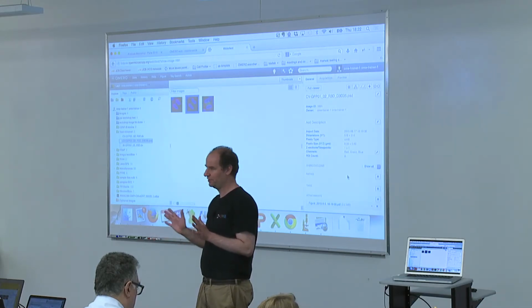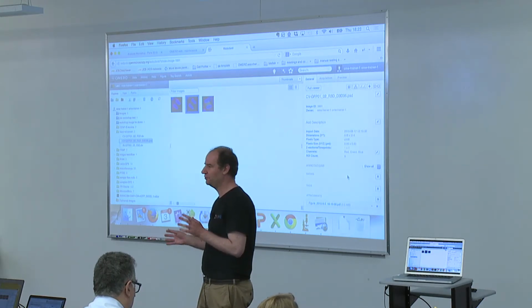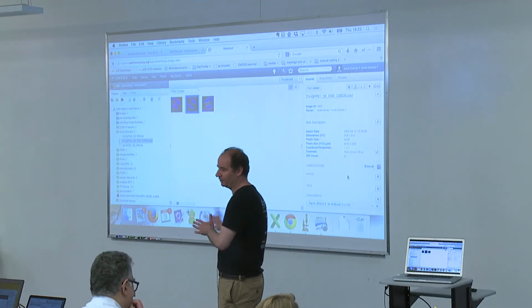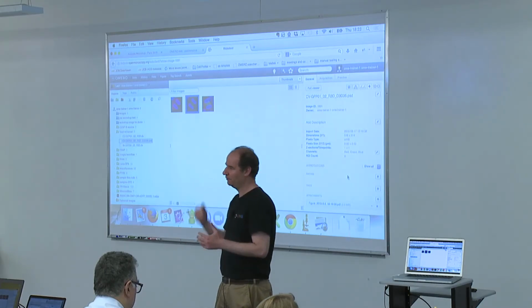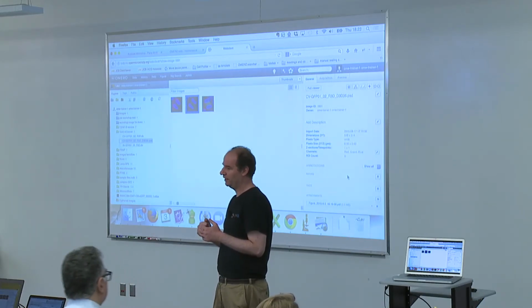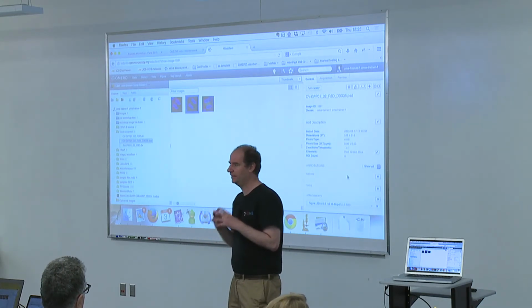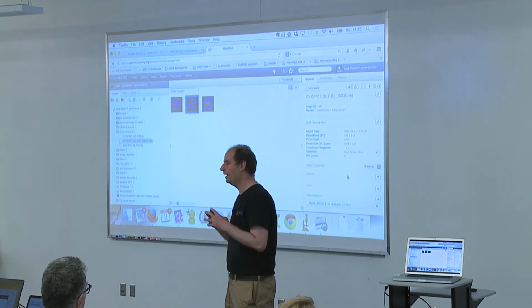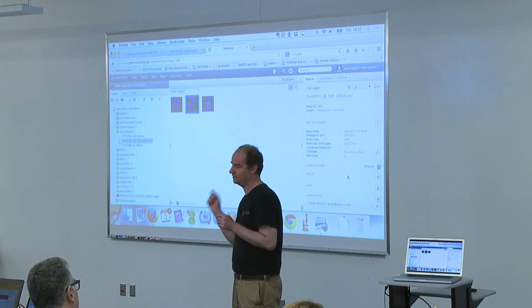You heard the previous question already. It's about the fine line between being reliable and robust and secure, and between allowing everything. We simply went rather this way because the strong voice of the people, we want our data untouched, is really strong. And they have a very good point. So for example, we made a lot of effort to make it really so that the data are in its original format, and you can, even without OMERO, go there and the file will be there exactly as it was.